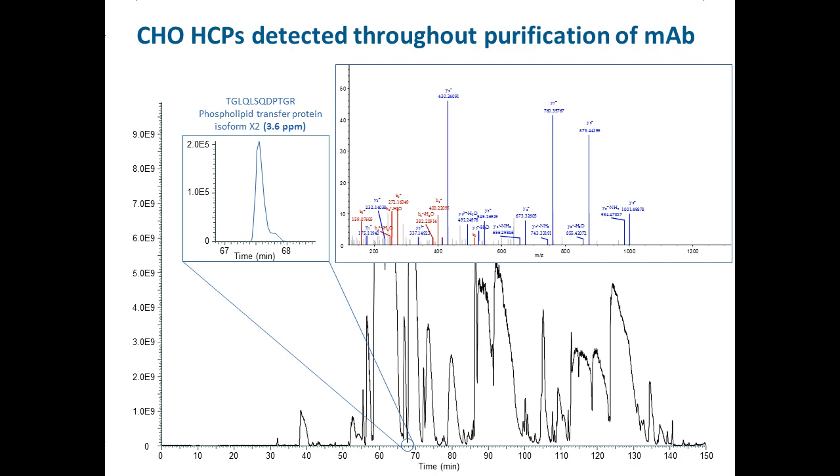Now when we also consider the base peak chromatogram, it becomes clear that the column is overloaded. So we do have some very broad peaks, and these broad peaks that we observe can all be traced back to the therapeutic product. Peptides originating from the host cell proteins, on the other hand, give nice Gaussian and sharp peaks, as is shown here in the inset of this chromatogram.